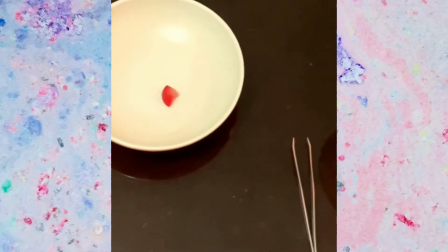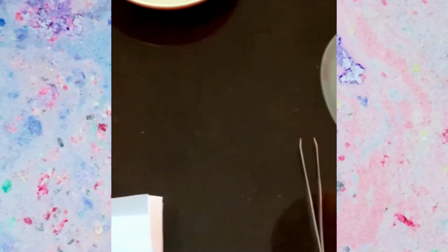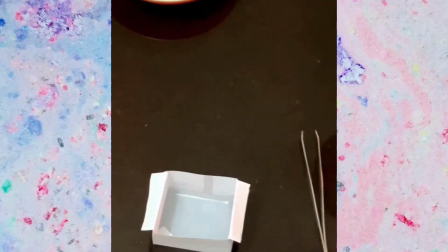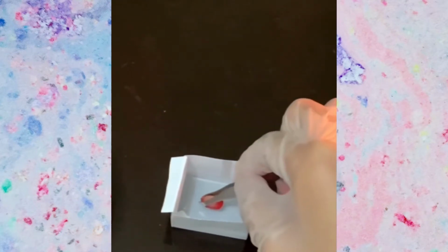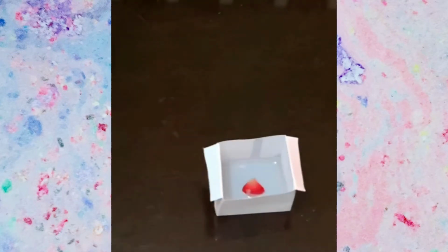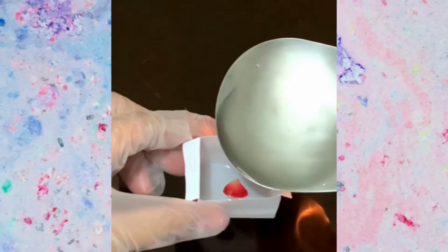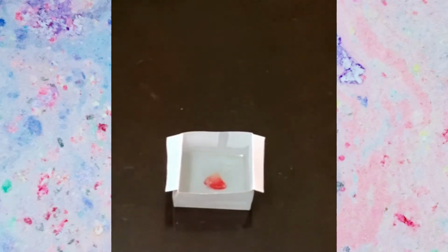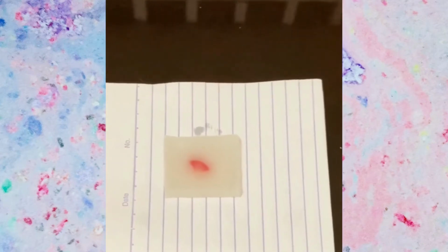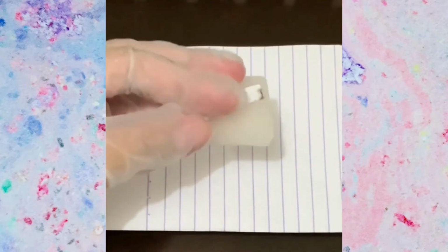Then fill a mold with a small amount of paraffin wax as our base. Immediately transfer the tissue into the central portion of the mold. Then dispense again an ample amount of wax to complete our tissue block. And don't forget to observe the proper orientation of the tissue. So this is now our end product, a solid block of wax encasing a section of tissue.